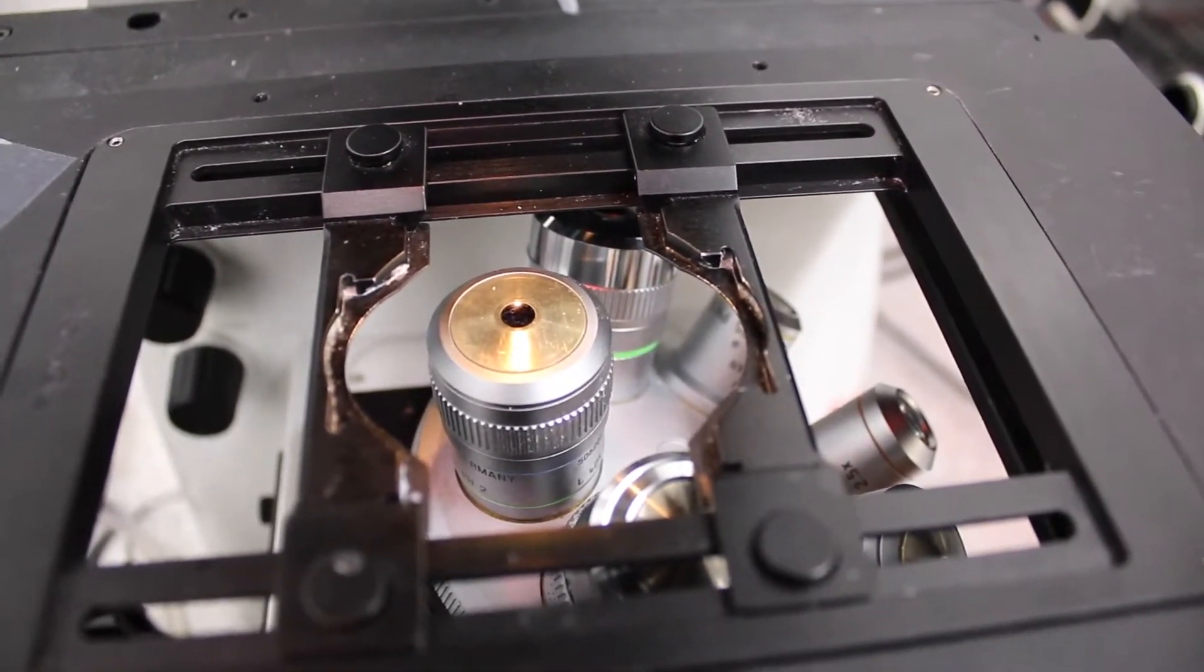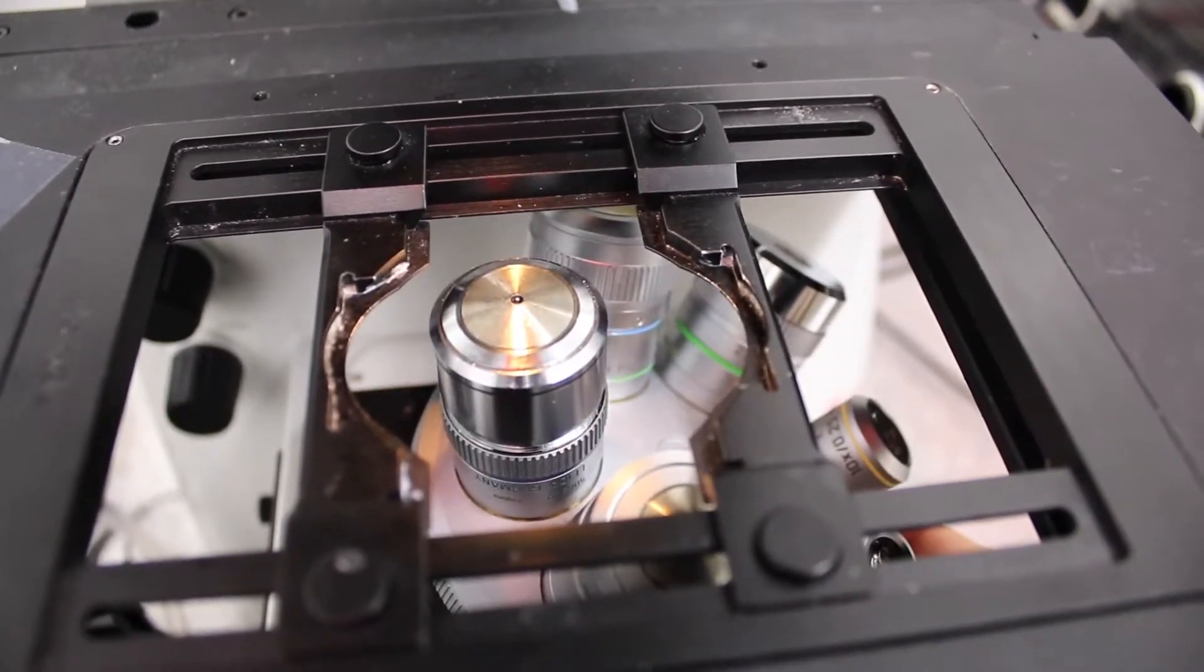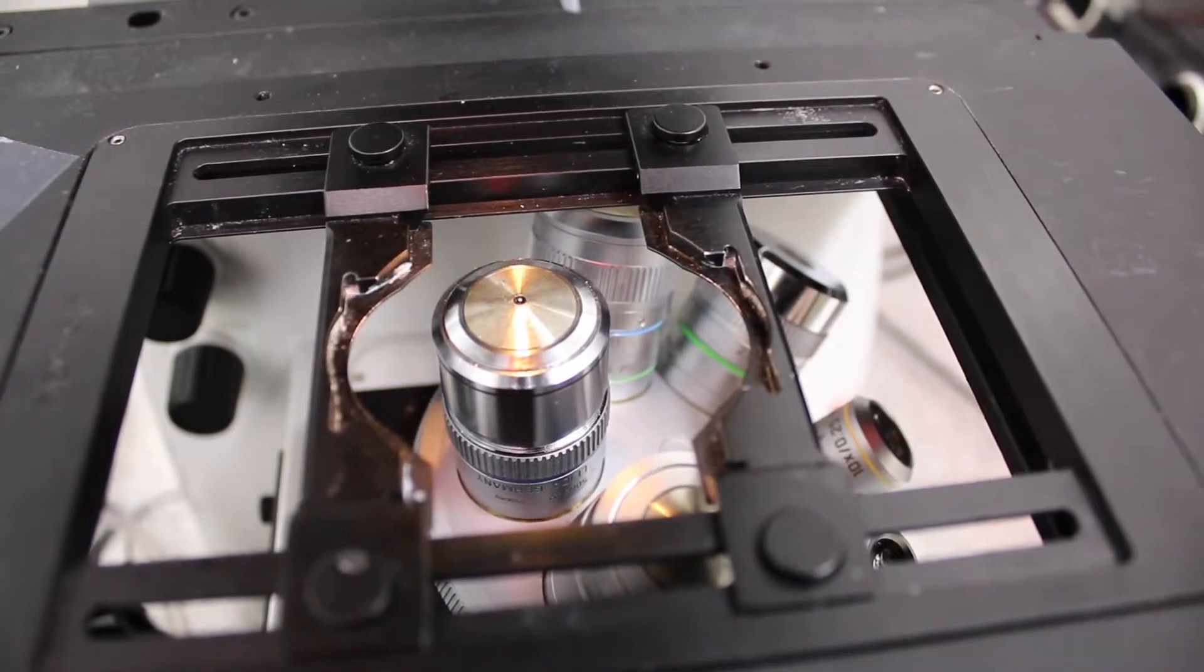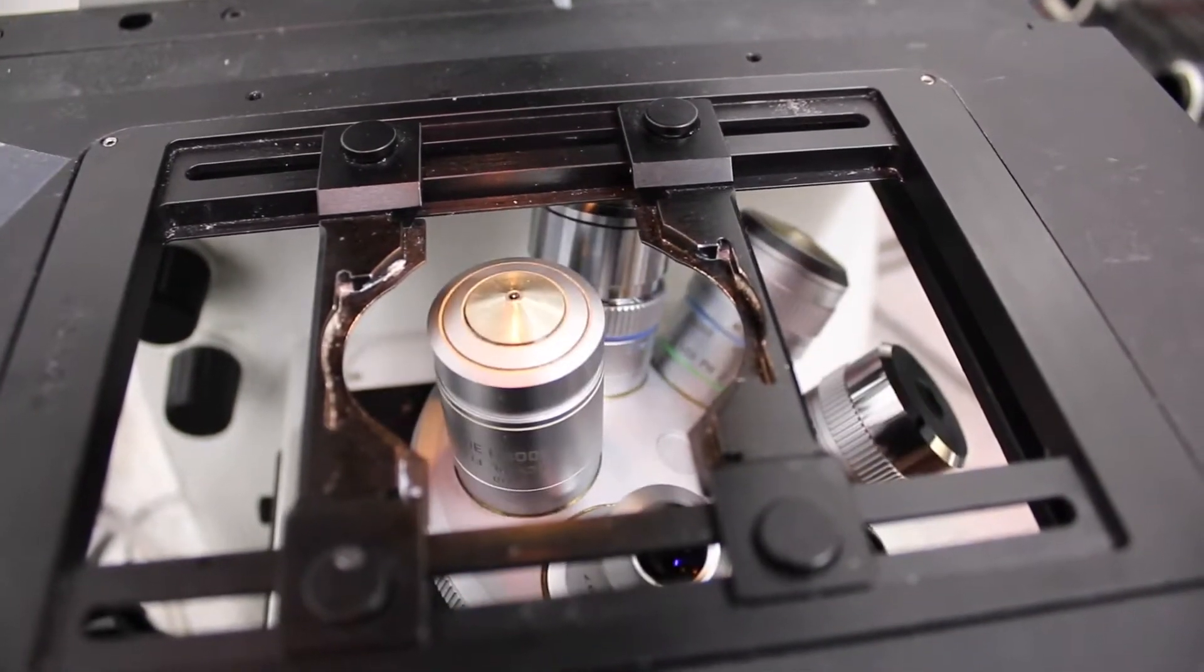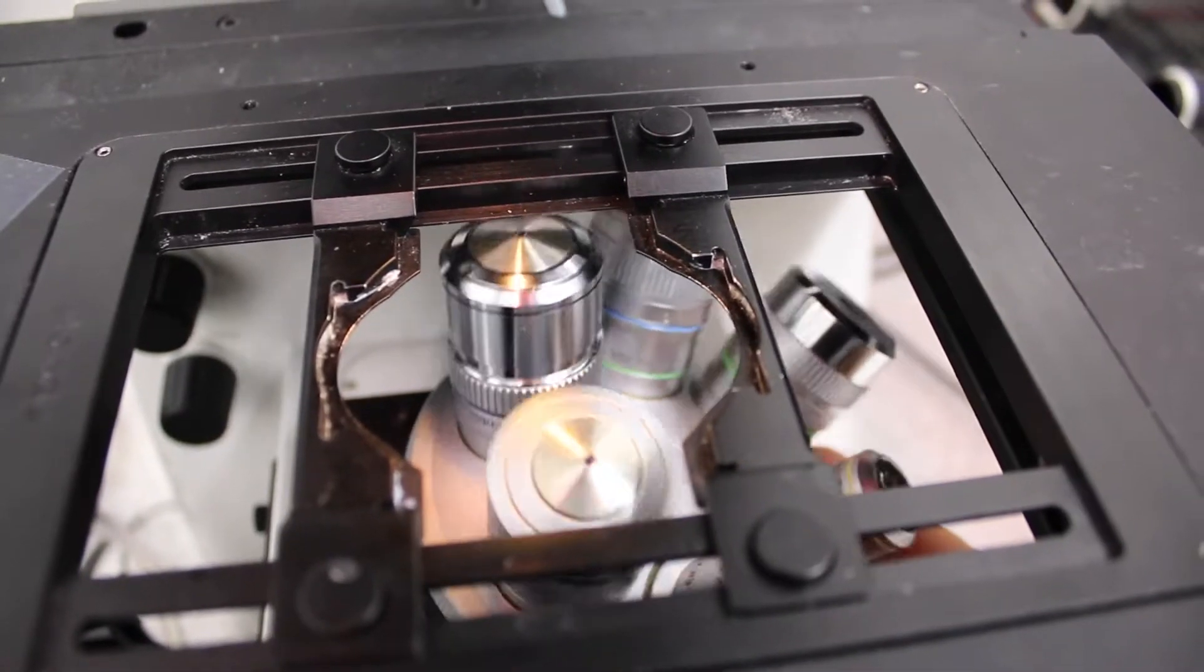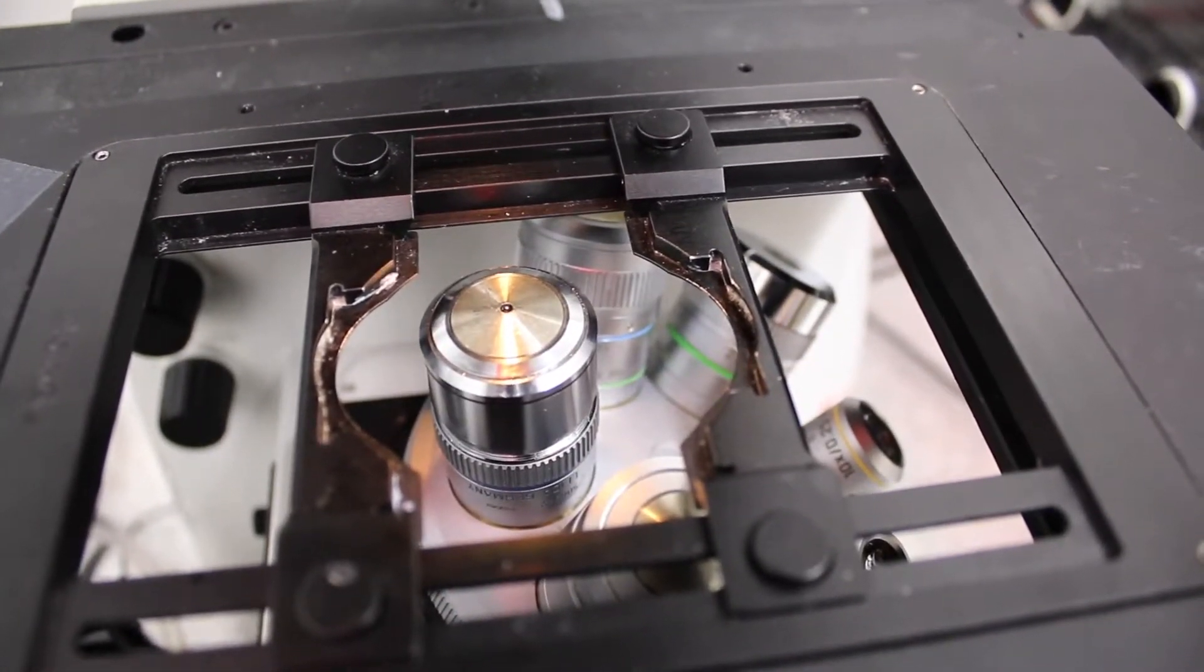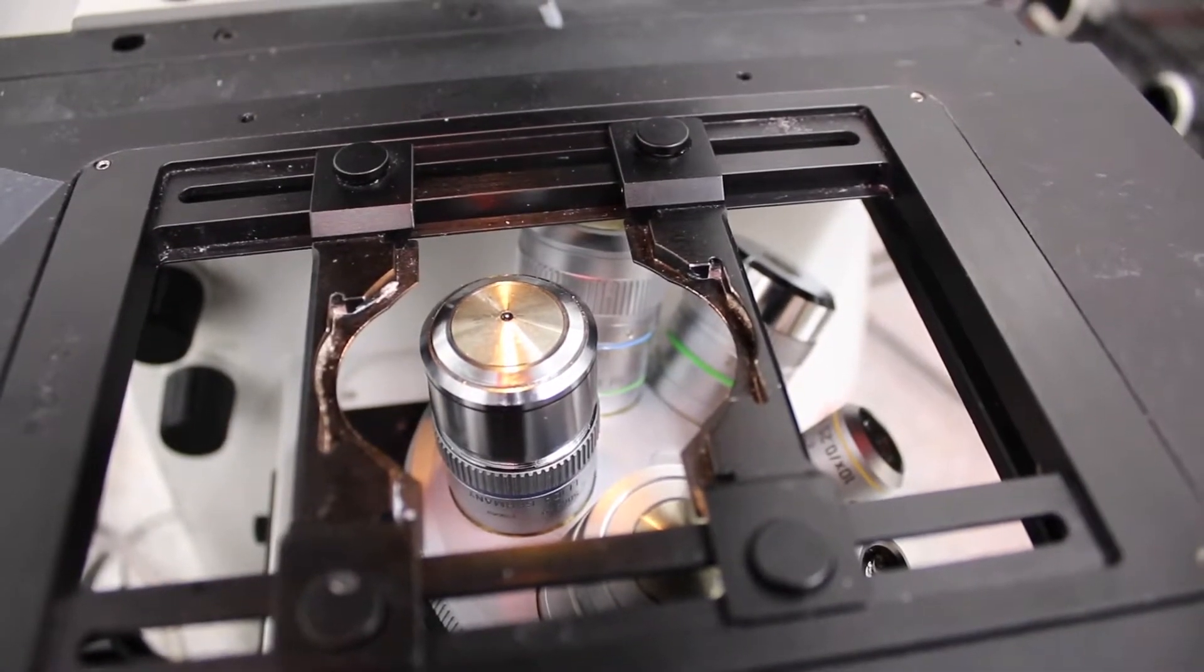And so from 2.5 to 40x is air objective, so you don't need to put anything on the objective. Then moving on there is the 63x, and here as you can see the aperture is much smaller. And the 100x, which is also very small. And these two objectives, so the 63 and 100, are oil immersion objectives. So you will need to put an oil drop to use the objective.